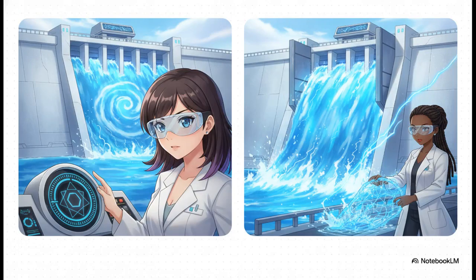But here's the thing. How we interrogate this system changes absolutely everything. In potentiometry, we're measuring the desire for charge to flow as voltage without actually letting it run. It's literally like measuring the pressure of water behind a closed dam. There are no reactions actively taking place. Conversely, in amperometry or voltammetry, we open the floodgates. We apply an external voltage to the cell and measure the actual flow of electrons as electrical current.